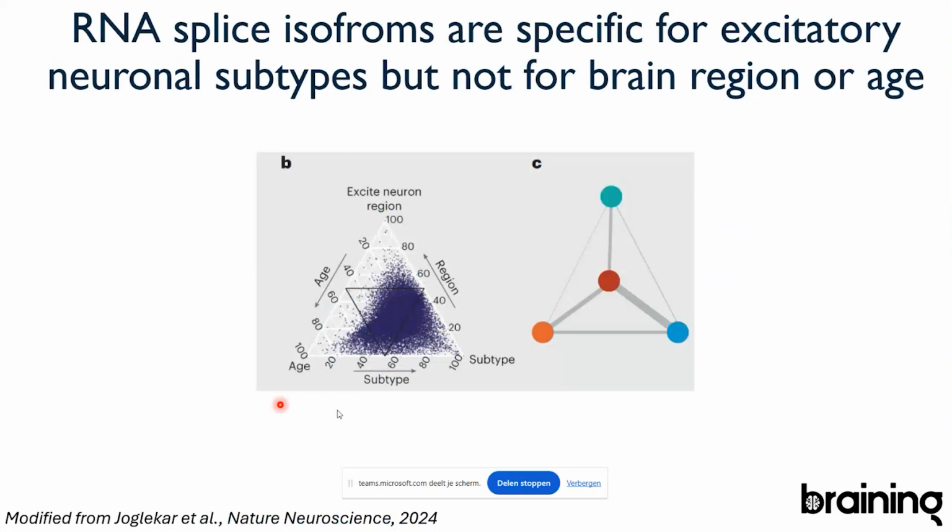For example, the information that you can get from that, if you do a proper bioinformatics approach, is you can look at all the isoforms of RNA that are expressed. And here, in this case, they looked at different types of neurons. They looked at excitatory neurons versus interneurons. They looked at neuronal subtypes, so for example, neurons in the first layer of the cortex versus neurons in the sixth layer of the cortex, and they also looked at age. And so basically, you can get a lot of information from here.